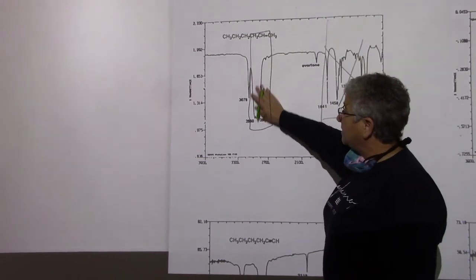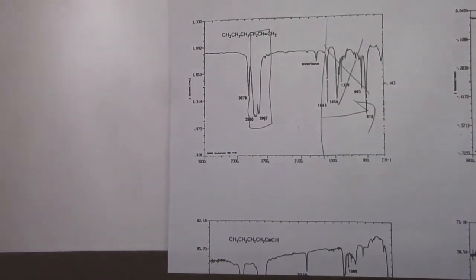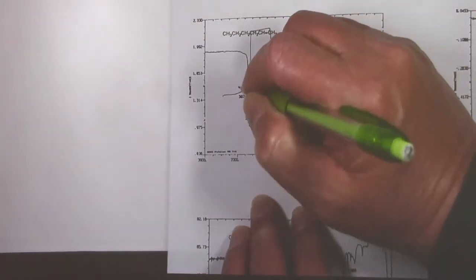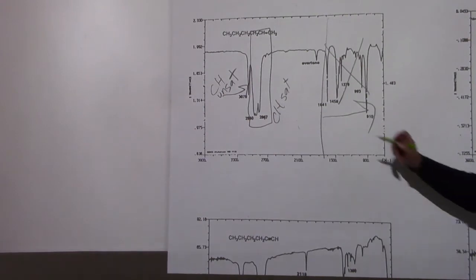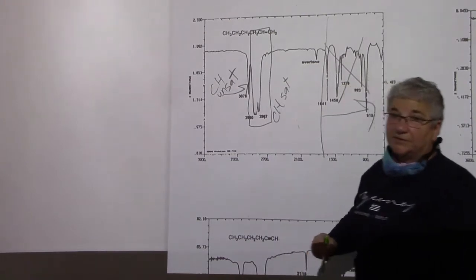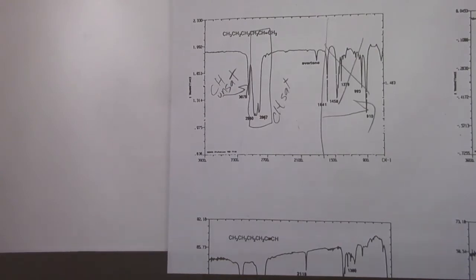And then I have my CH saturated. And in this case, at 3078, I'm actually seeing CH unsaturated. So these are CH saturated, and that is CH unsaturated. And these absorbances in here, again, are because of the 3 hydrogens bound to those carbons. They are CH stretches, though.